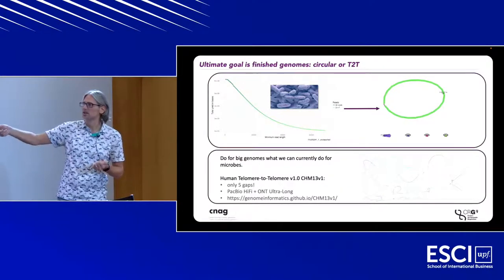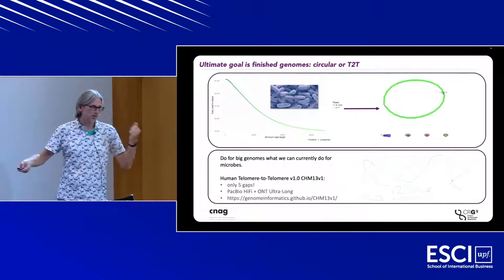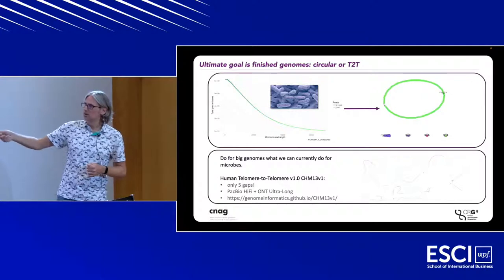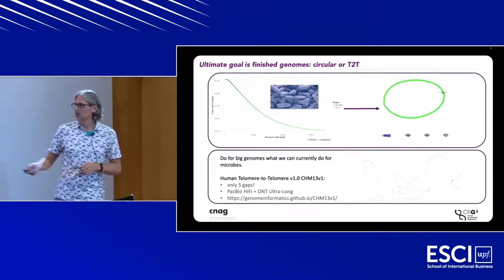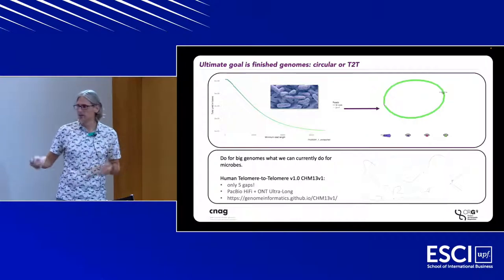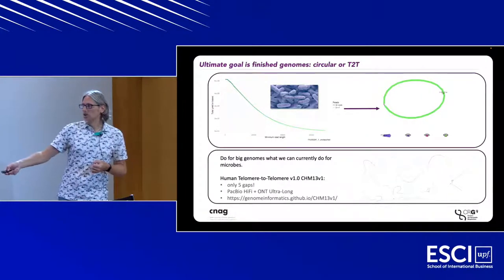This is a Klebsiella pneumonia, causes disease. So using long read technology, we can assemble these, get high quality genomes, and basically you get the graph and you see the reality. We're coming a long way.